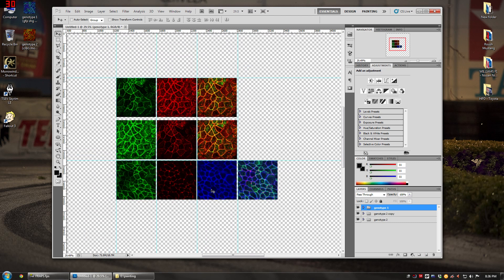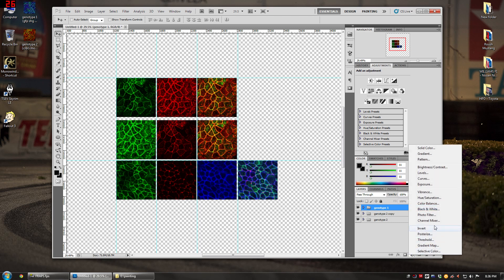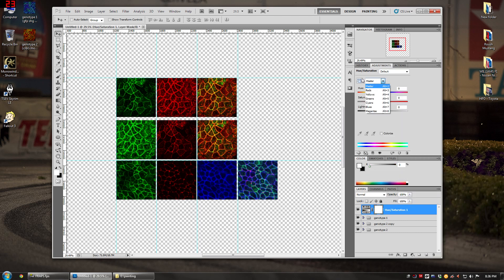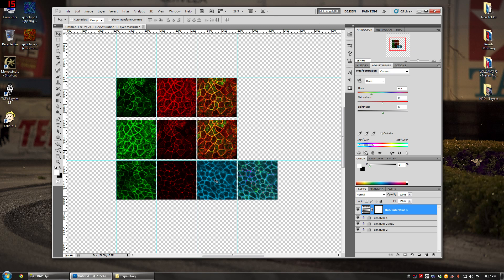Blue typically doesn't show up very well, so I do a hue adjustment on it. Place a Hue/Saturation layer on top of all images, go to where it says Master, switch down to Blues, and do a hue shift of -47. This makes the blue a cyan color that's much easier to see, and it only acts on the blues without affecting any other colors.